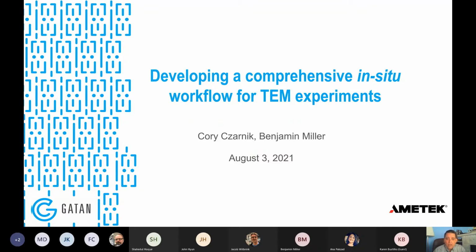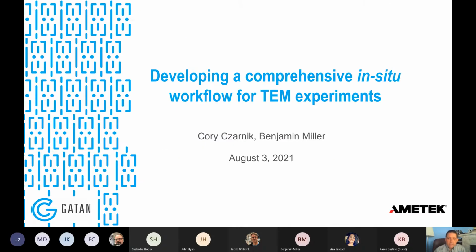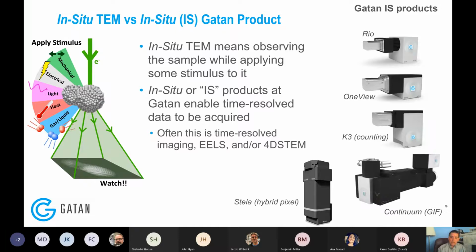Okay. And with that, we'll launch into the tutorial for Developing Comprehensive In Situ Workflow for TEM Experiments. Different people have different ideas of what an in situ experiment is and what the ideal workflow is. So this isn't intended to be a product-specific pitch. It's more talking about the ecosystem that Gatan has developed to integrate tools and integrate in situ functionality for those tools into GMS and Digital Micrograph.